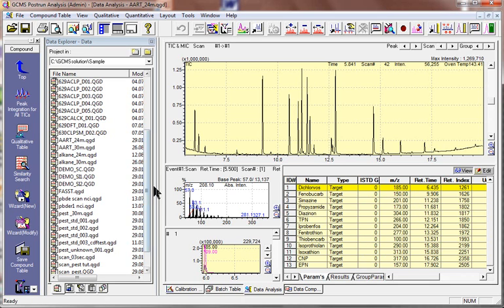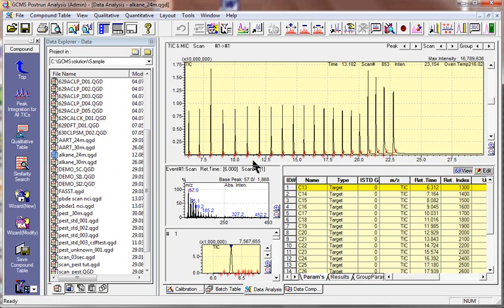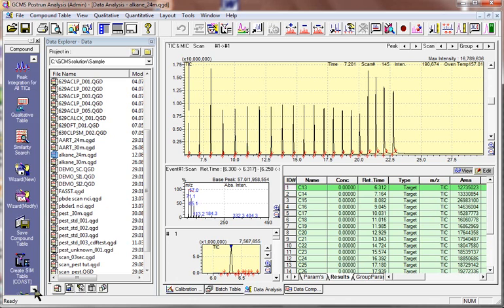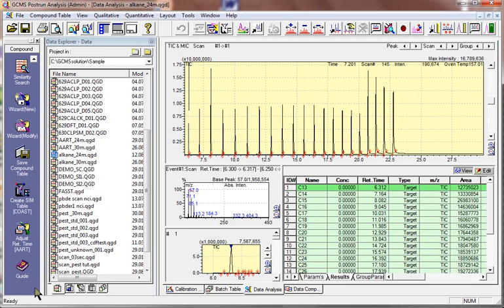So the next step is to measure a 24 meter alkane standard with identification of the corresponding retention time, retention index, and integration result. This is now based on the 24 m, and the next step is to update the compound retention time of the pesticides, of the targets.